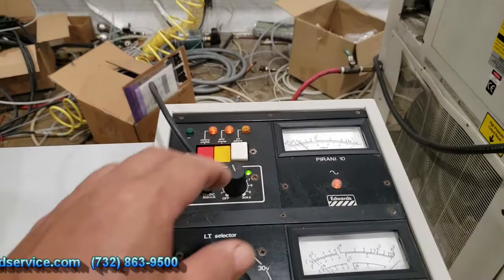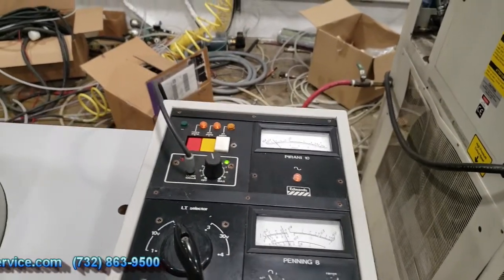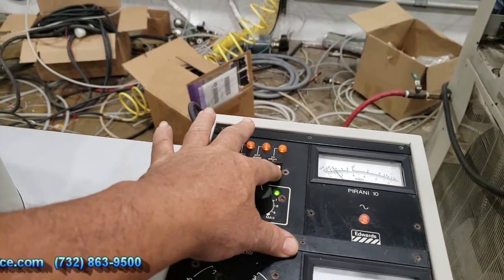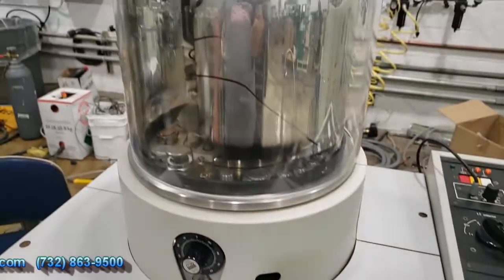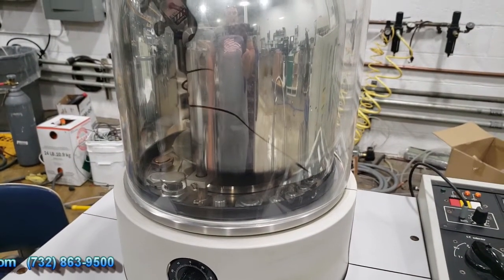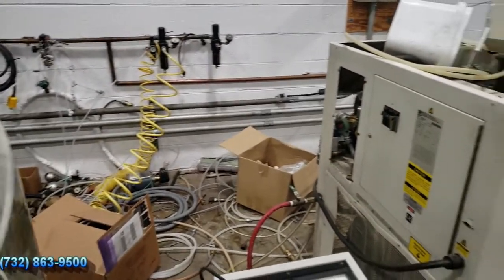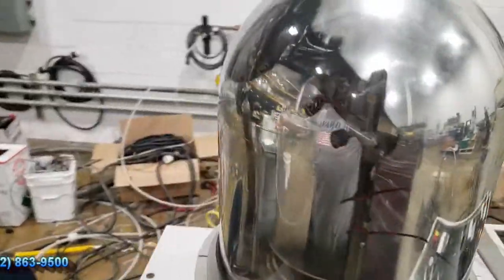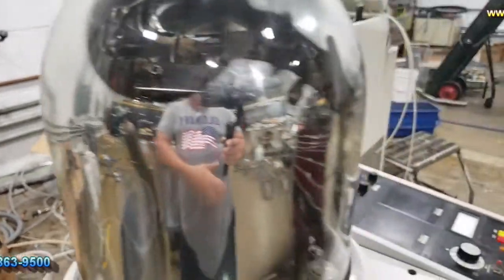What I can do now is turn off my penning gauge, and then I can hit the air admit. What that's going to do is allow air in — it's going to allow you to air the bell jar — and what I'm going to do is take the bell jar off.